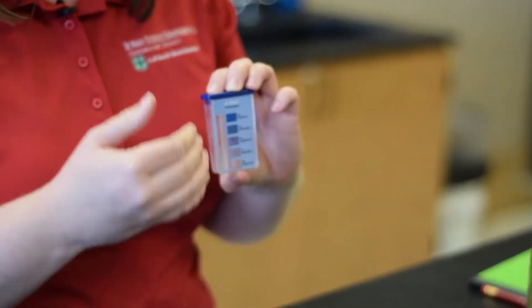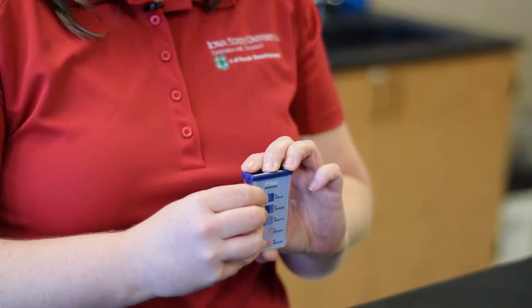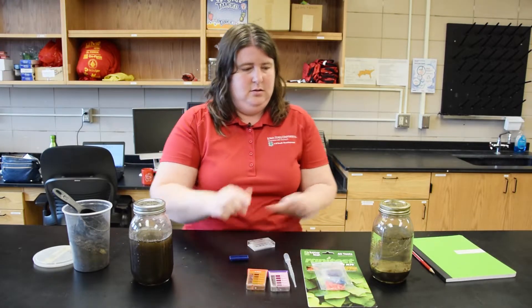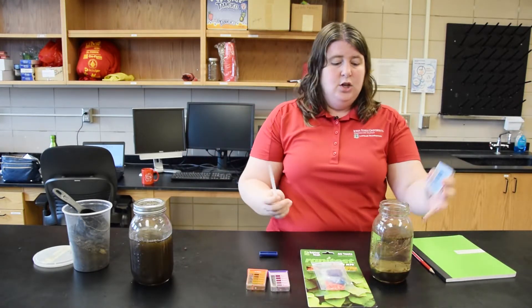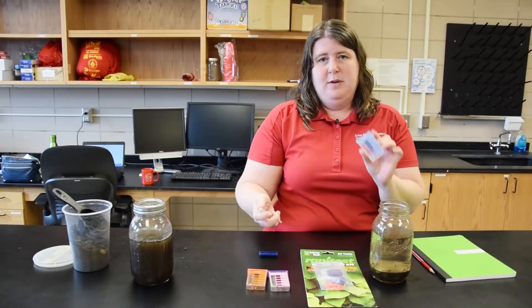Then you'll use the testing kits to do the soil tests. These are color coded — you add a chemical and that chemical reacts with the nutrient and you will see a color change. The more of that color, the more of that nutrient is present in the soil. You're going to fill up the container with your soil solution, taking from the top of the container. You don't want to get down into where the soil has settled, as that'll be too dark and cloudy and you won't be able to read the test results.